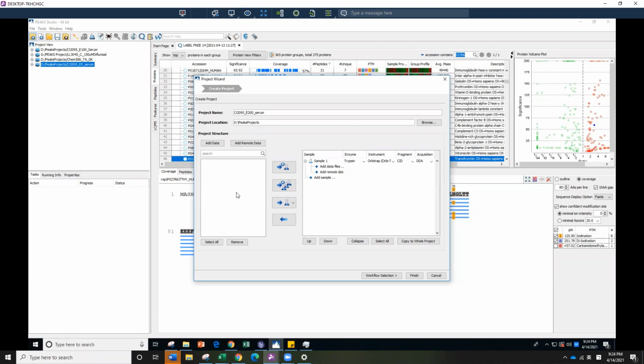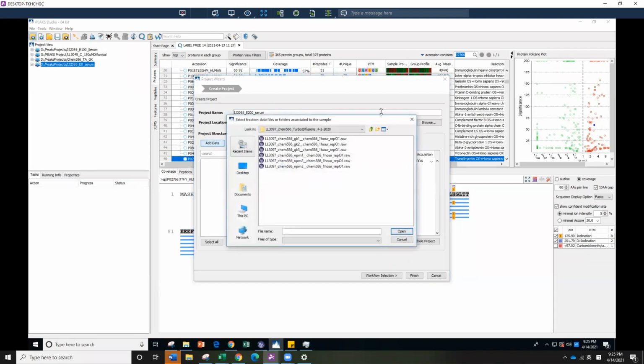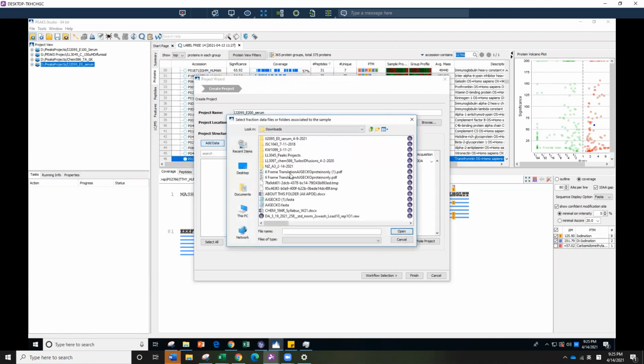So you can technically have 2 copies if you constantly back up. And the other thing is if you could not find a project in the D drive Pix project folder, then just go to Synology and find it, because after he backs it up, he will delete it.